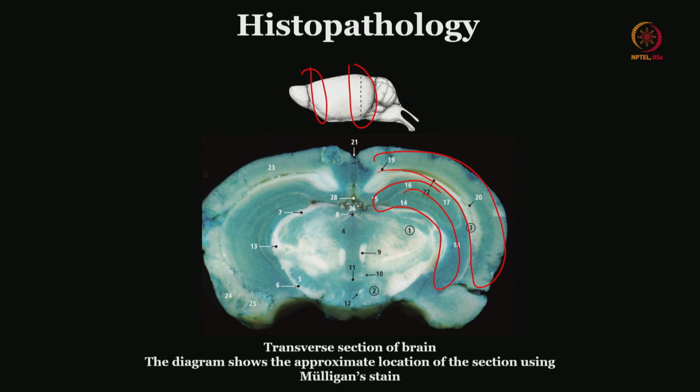So, you will come across various structures in the atlas. This is just to introduce how it would look like in the slide, alright. So, these are the deep cerebral nuclei, these will be the hypothalamic area, thalamic region. Initially we had seen it sagittally when we see it after splitting the brain in the center, whereas this you are dividing it in, this is called coronal section.